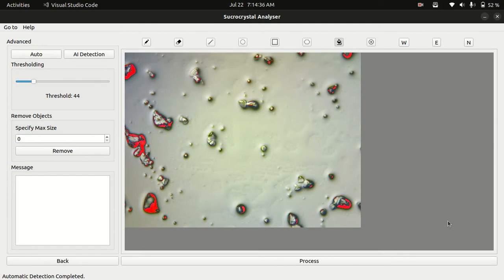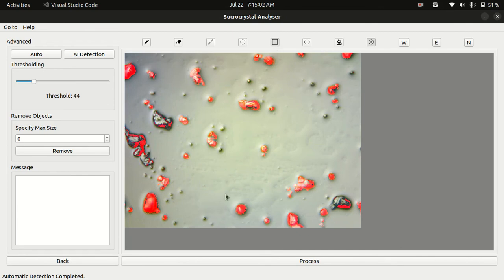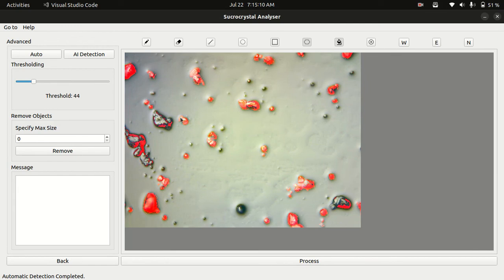There are multiple options I added here. Here is the auto button which is the same algorithm the software uses for the first detection which you saw in the previous step. I have multiple options to rectify the auto algorithm mistakes. For example, if I want to deselect an unwanted crystal, I can select this tool and draw a rectangle on this crystal and the selection will be removed.